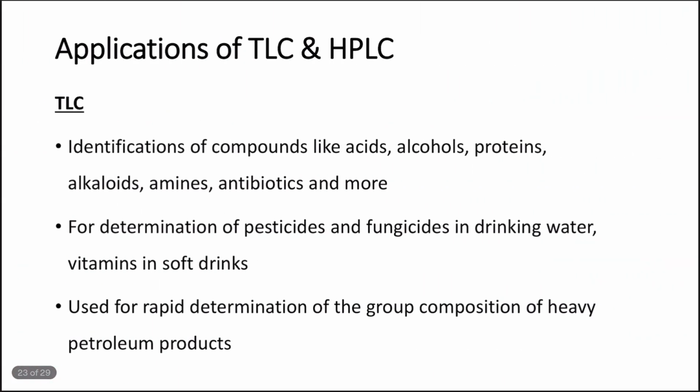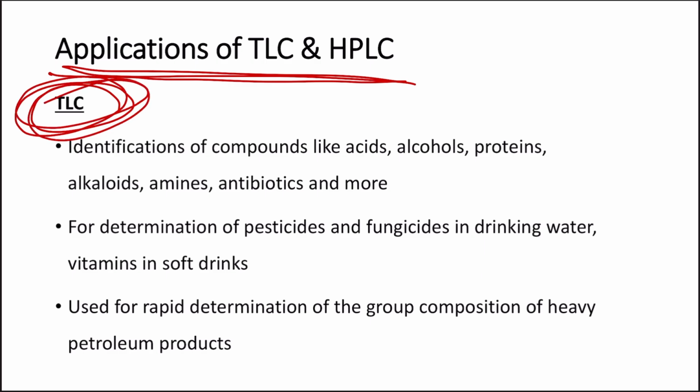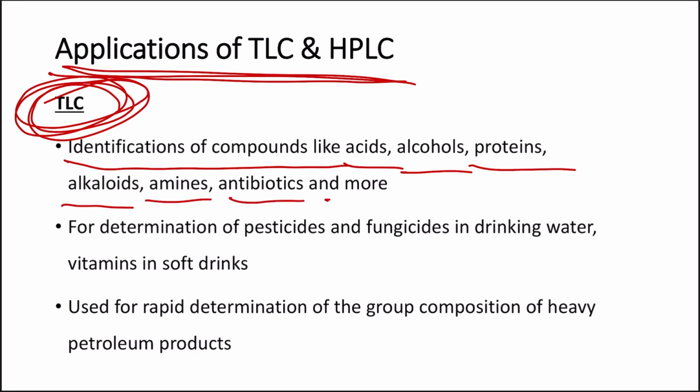Next, coming to the applications of liquid chromatography. First is the application of thin layer chromatography. It is used for identification of compounds like acids, alcohols, proteins, alkaloids, amines, antibiotics, and more. So basically the same application as seen in the case of gas chromatography.